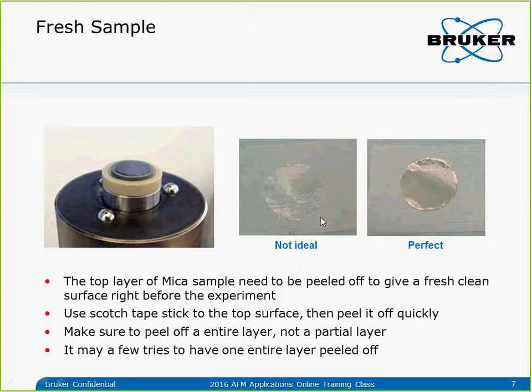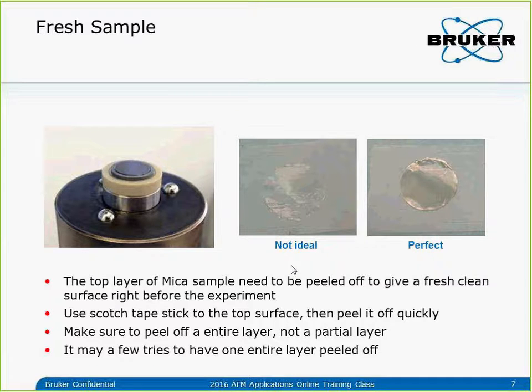When we land the probe we don't know if it's in the clean area or the contaminated area. If it's in the contaminated area, the tip will be contaminated immediately and we cannot get atomic resolution. That's why if this happens, I peel off a few more times until I get a good complete peel.